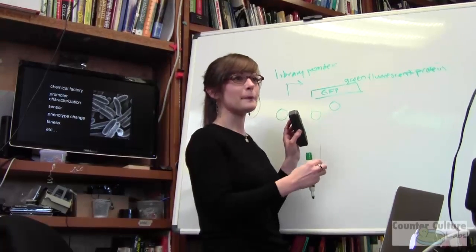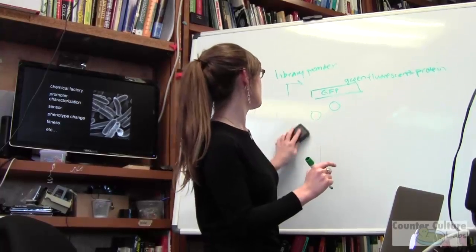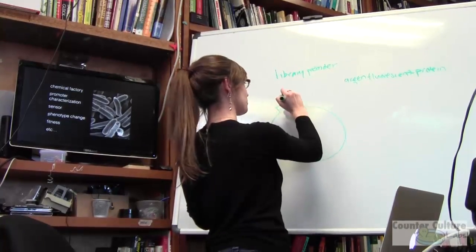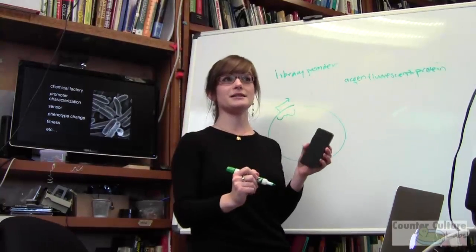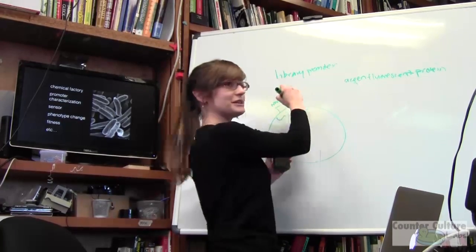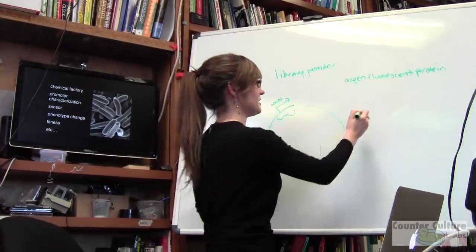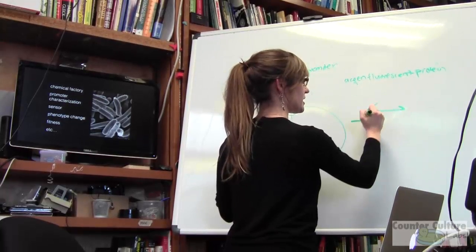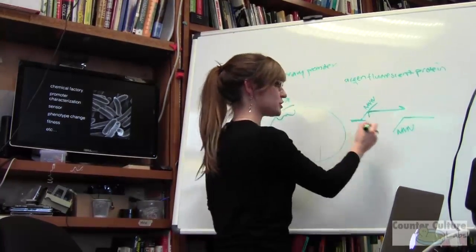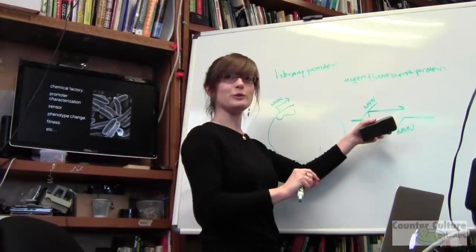How much would it cost to synthesize that? Yeah, so typically right now, it depends what you do. If you want to make your own promoter library, you can start with a base promoter. So if you had a vector and this was your promoter region right here, you could go to a place like IDT, Integrated DNA Technologies, and you could order primers that have random nucleotides in them. So this is a step towards some detailed molecular biology. If you had a primer that bound this way and had randomized nucleotides coming off of the end, and bound to your vector, you could amplify the entire vector and put random sequences where the promoter region is. And we could go into detail on that later.